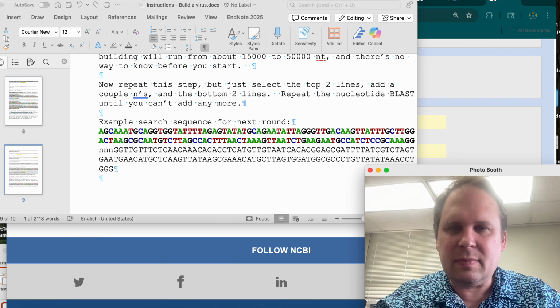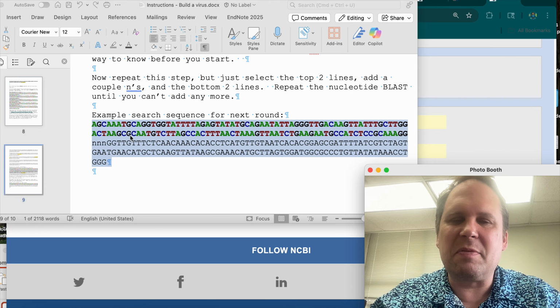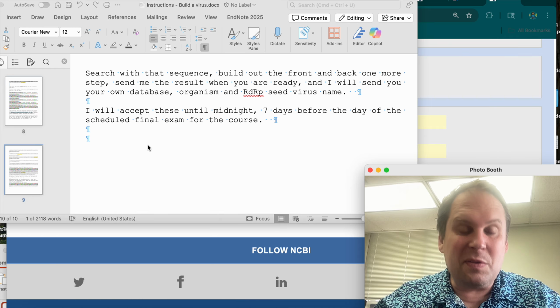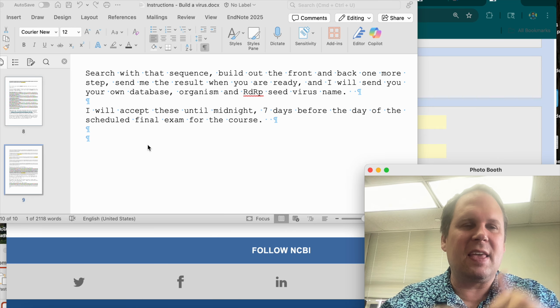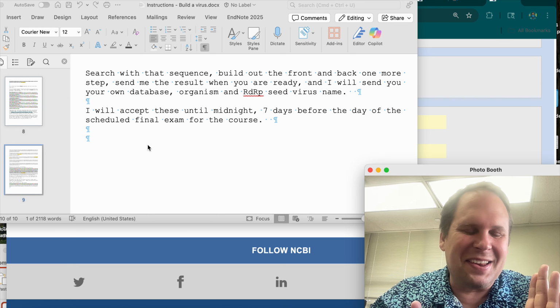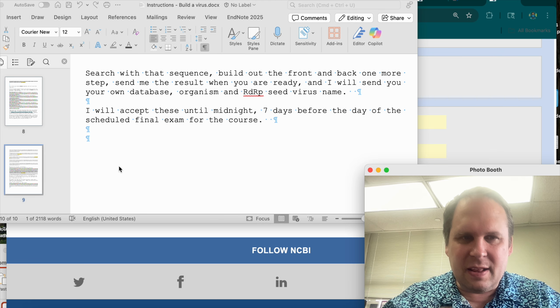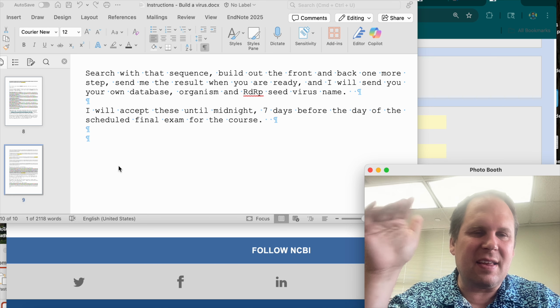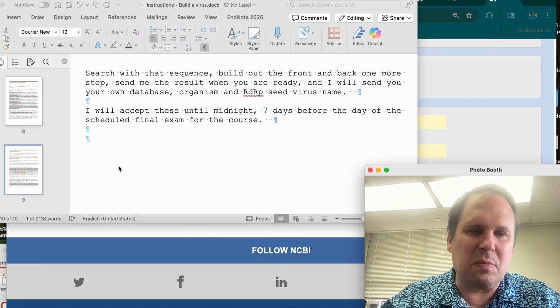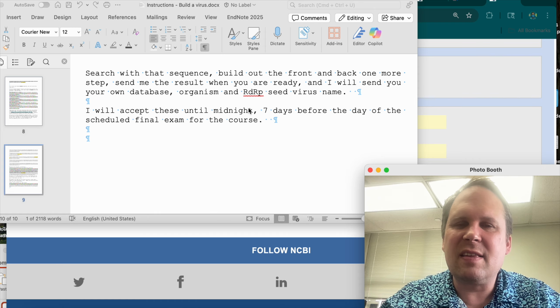So, final thing. When you're done, you're going to do one more round. So you're going to end up searching for this one, see if you can extend the thing that we already made. If you can figure out how to do that and do it successfully, send me the thing that you just built so that I can see that, yeah, okay, this person has made it longer and it does kind of match with what the virus is supposed to be. There's plenty of little tips and tricks in there for the ways that it commonly goes wrong. Read them. They're in the correct section where right after you do the thing, it'll say, hey, if it goes wrong in this way, this is how you fix it.